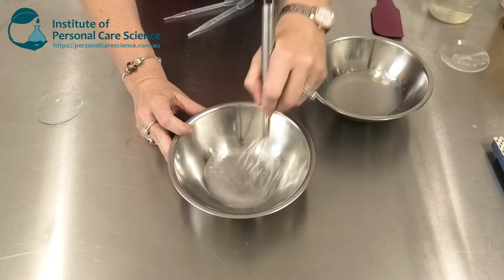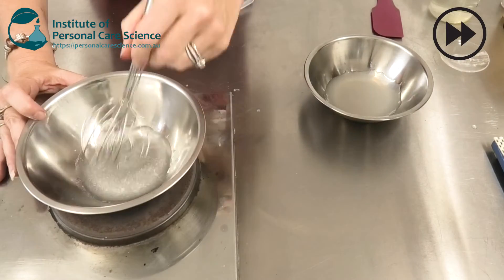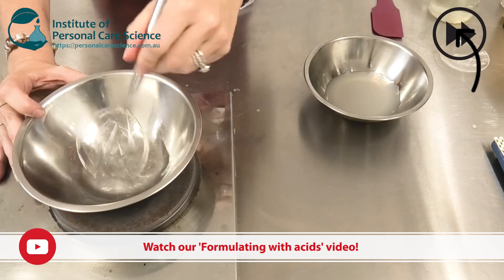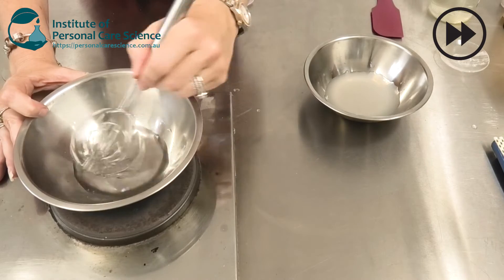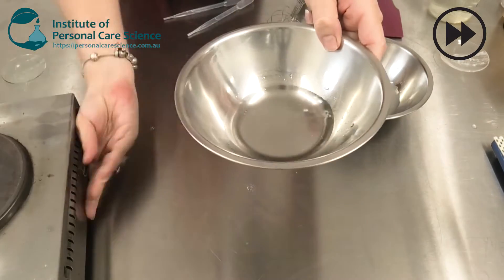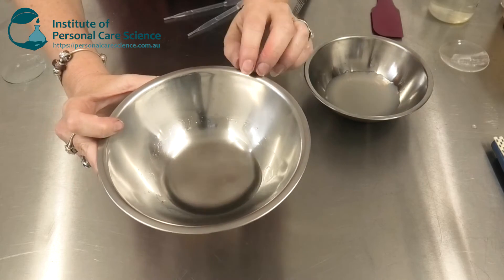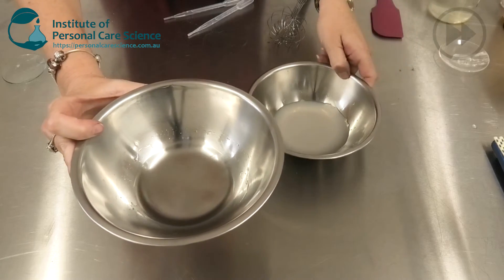If you heat this gently you'll find it will dissolve really well. As you can see, using that method makes it really easy to dissolve all of the salicylic acid, and one of the great things about dissolving it in this way is it won't recrystallize in the gel.